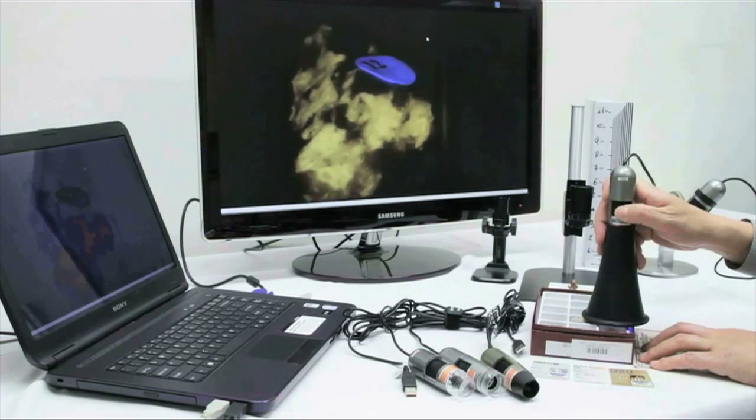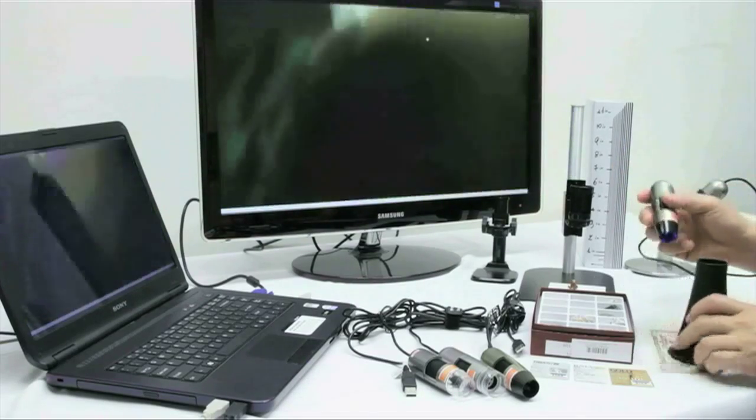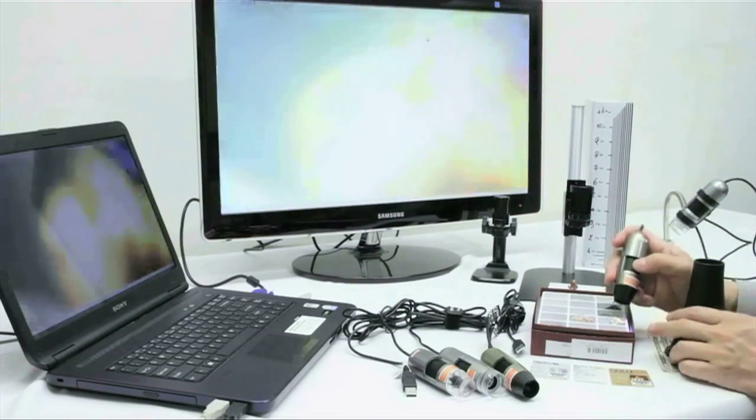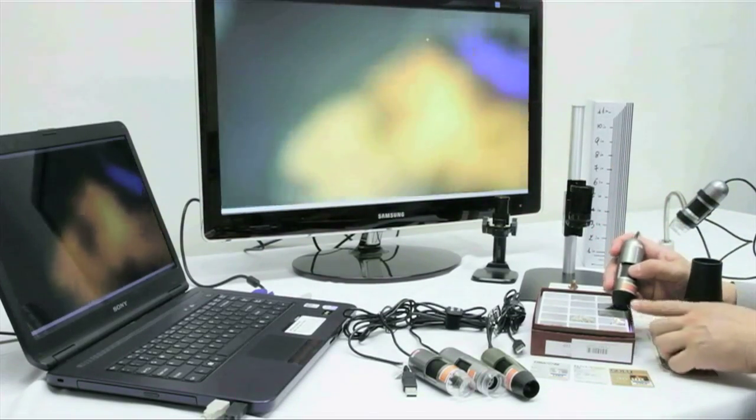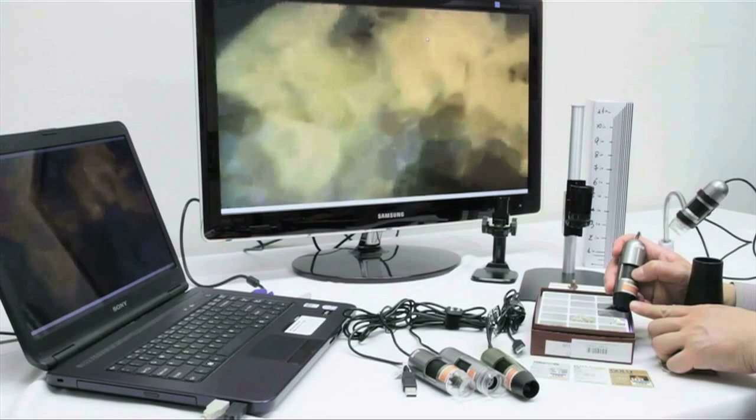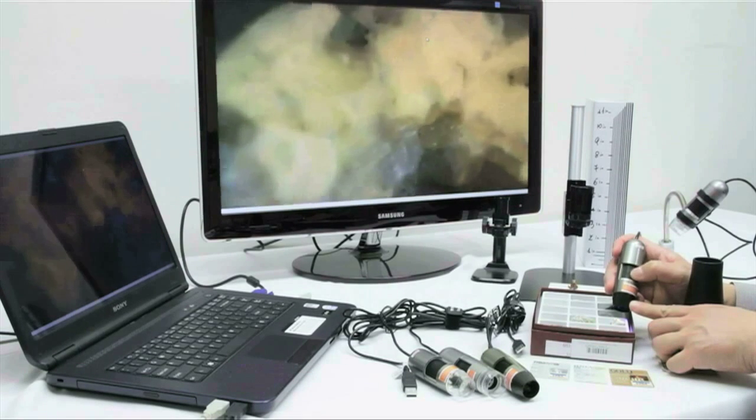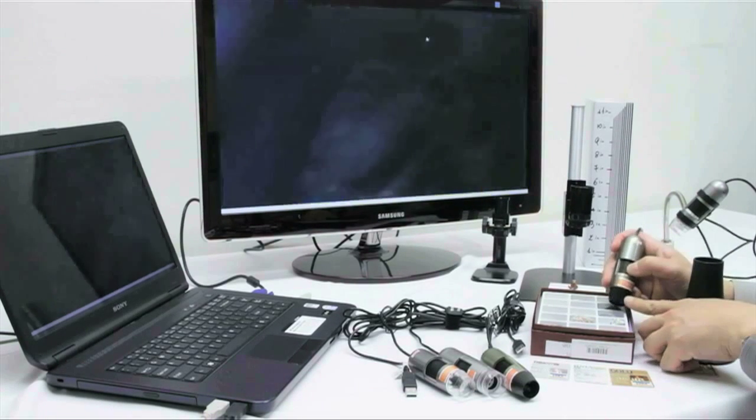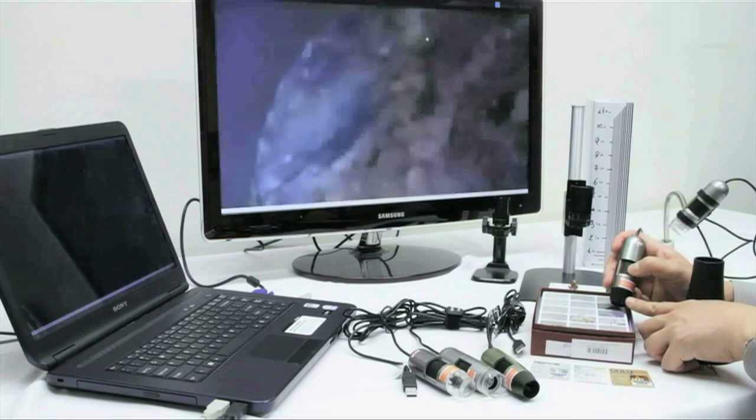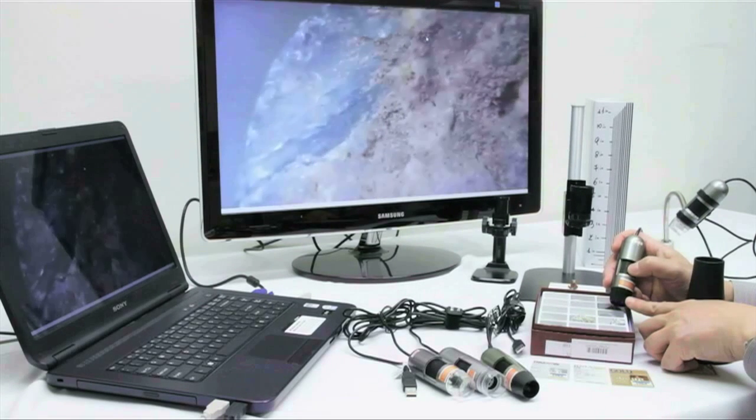Some of the rocks will fluoresce, and some of them will not. So that is what you are seeing here. We are going to hover over some rocks, and some of them will fluoresce and give you a nice picture, and then some of them will not that are missing the fluorescent minerals or contaminants.